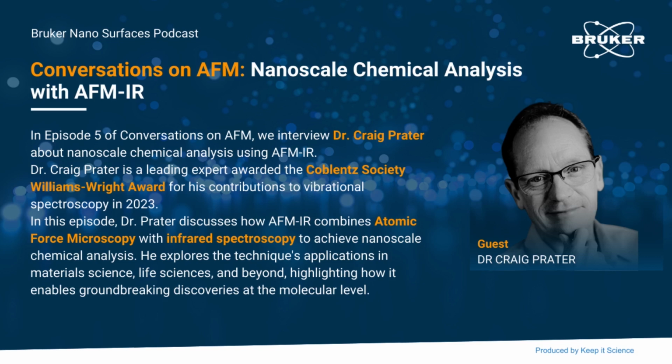And we proceeded to try over the years a wide variety of techniques to understand more of the what is that. We would figure out ways to probe the electrical properties, the mechanical properties, the friction, the adhesion, other topics that you may have discussed in previous podcasts. And all of these approaches gave us information about the material, but it didn't give us any kind of unique identification of the chemical composition of the material we were looking at. And so AFM-IR is a technique that solves that problem by using the chemical specificity of infrared spectroscopy and the high spatial resolution of AFM.